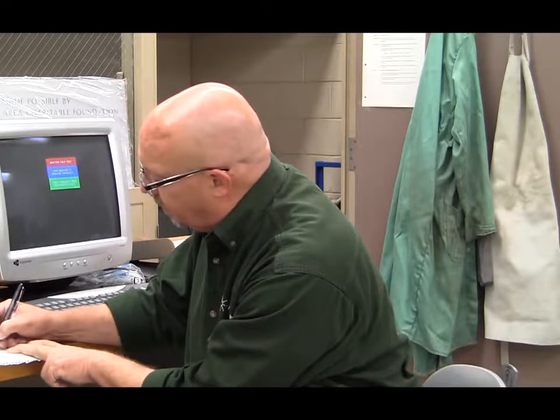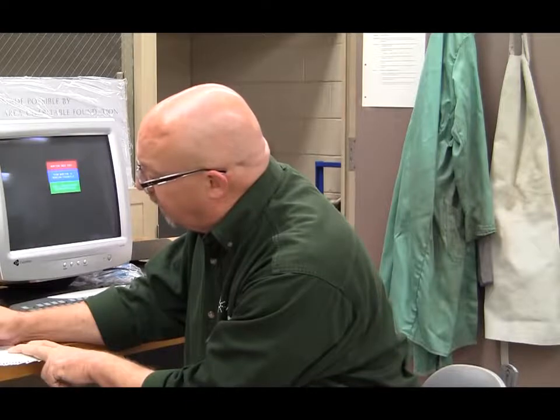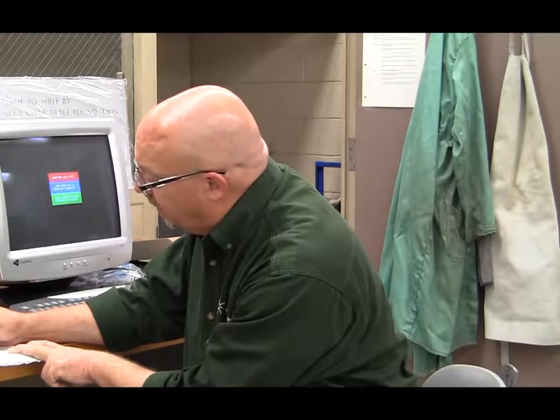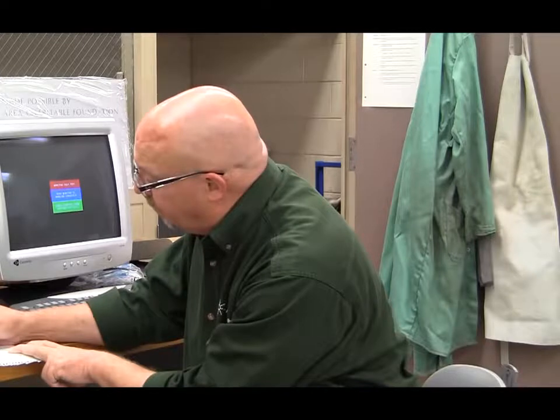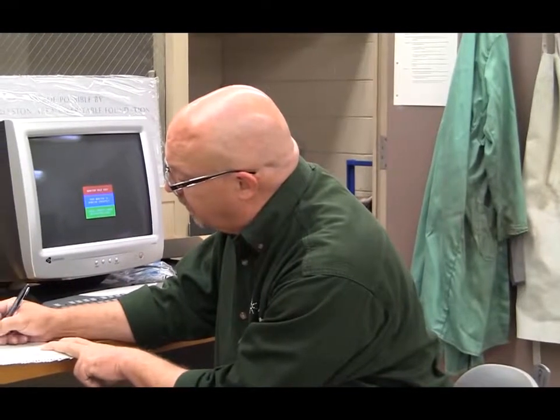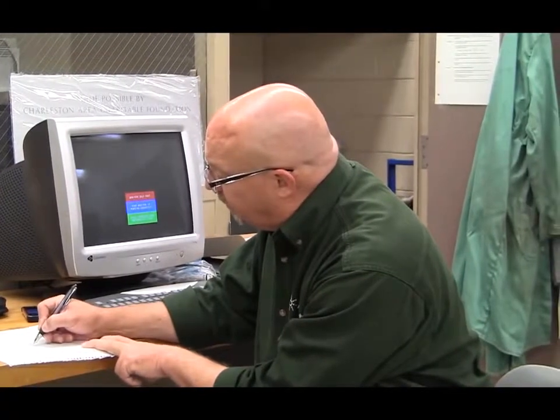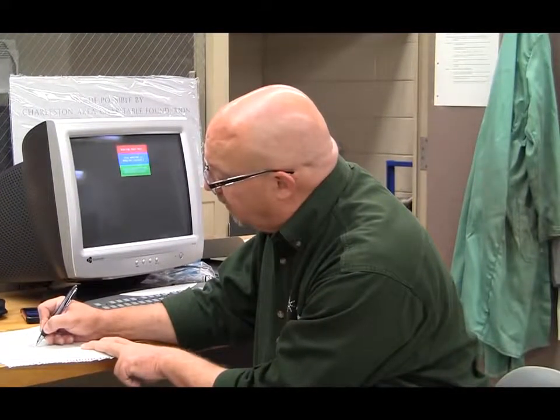That tiny capillary will come out to a valve, and it can either be this way or this way. On the back side, that'll have that pressure release. And then it will come out of this same fitting down here.